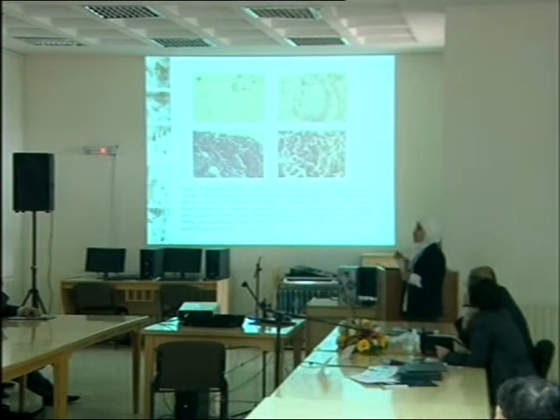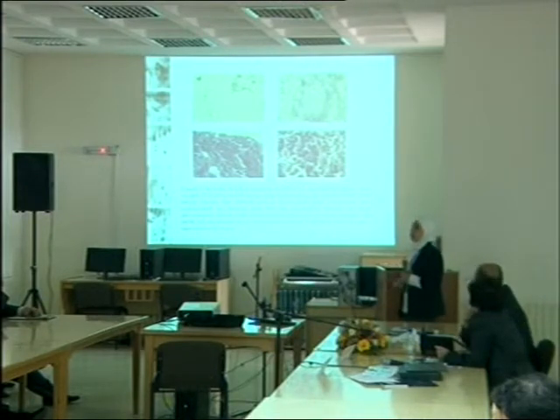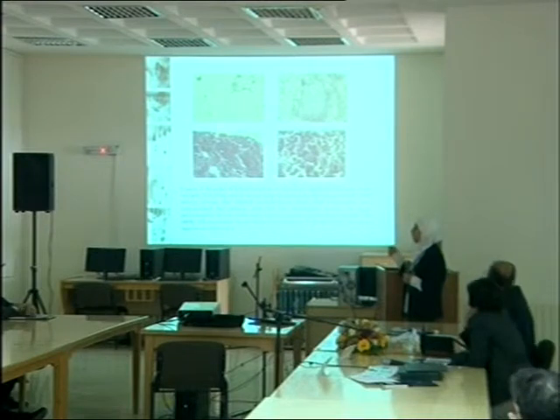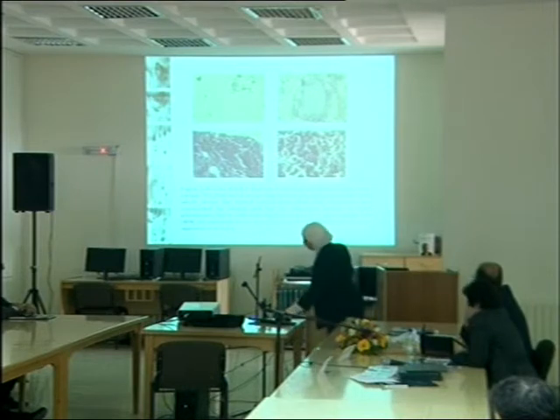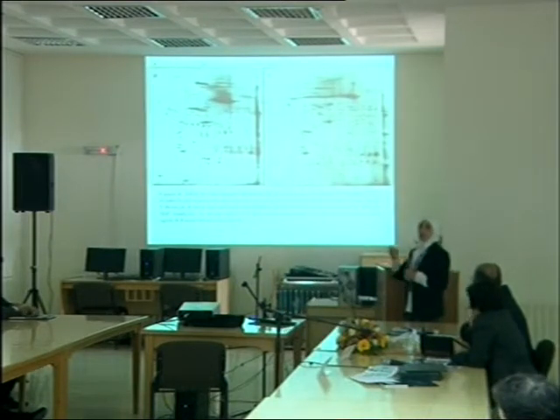The question was, how do we make sure that the samples given to us by surgeons as normal are normal, and the tumor samples are what they claim to be? So we did our own H&E staining to identify tumor cells, tissue cuts from tumor cells, and the normal. You can see there are a huge number of slides to show that, and we only process the samples that present a normal tissue.